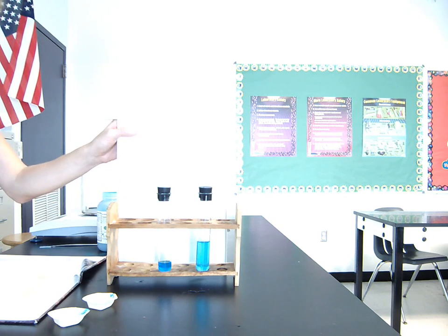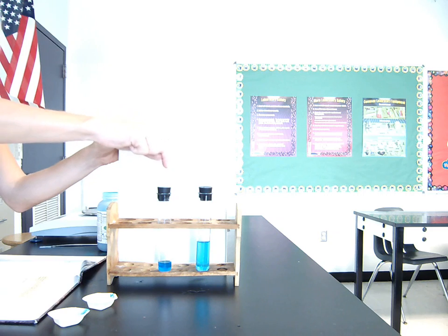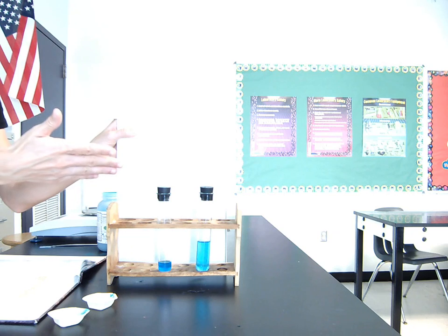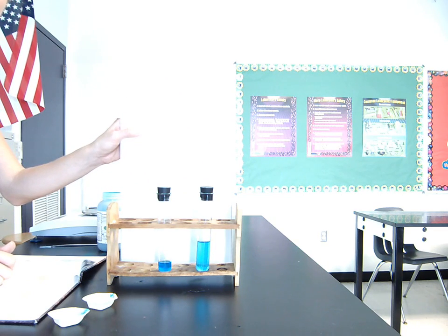Alright, so let's look at the second set of Blue Dot questions. It says, did the 0.3 grams of blue solid dissolve as well in 20 cubic centimeters as in 5 cubic centimeters? Well, yeah, it dissolved equally as well in both test tubes. That's not saying they're the same color. That's not the same thing. What they're saying is, did it dissolve as good in here as it did in here? Basically, both test tubes completely dissolved all the blue solid the second time as well. And so yes, it dissolved equally as well in both test tubes.